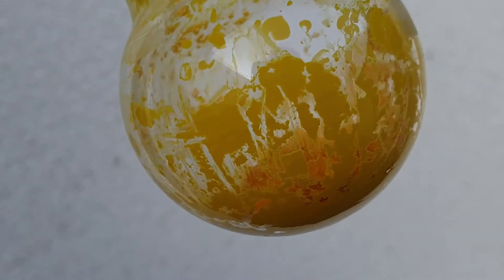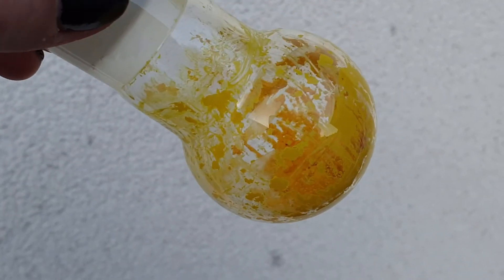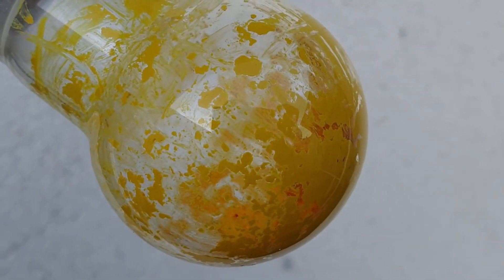This is the end product, and I'm not going to isolate it or determine yield, since for that I would have needed to boil off all the sulphuric acid, which is a pain to say the least.